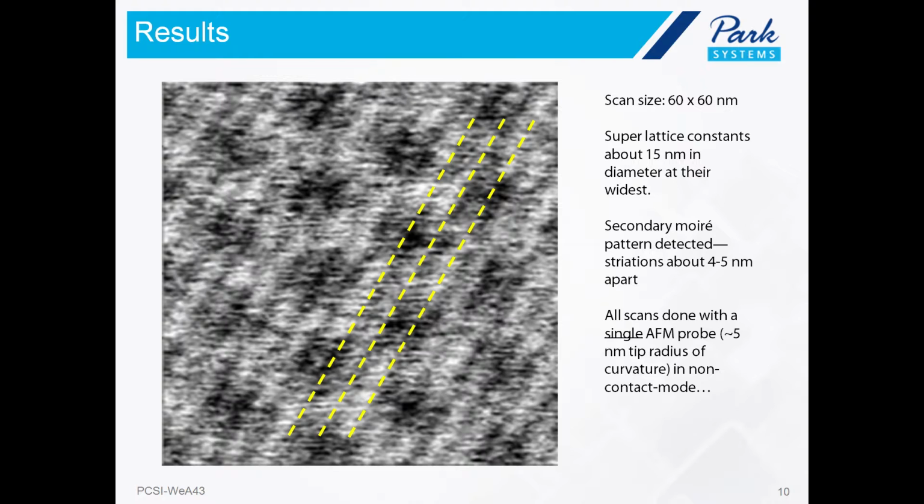We did do this at a series of different scan rates, so it's probably not an artifact there. And we also did this scan with the sample oriented differently on the stage, so it's not a product of the sample being oriented in a certain direction. But it just goes to show you again, SPM, particularly AFM, definitely has more and more applications that are just limited by probe geometry at this point.